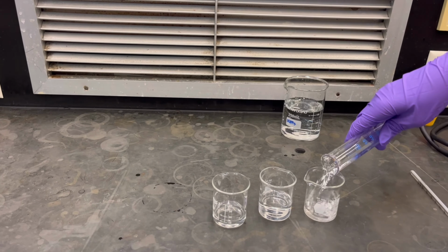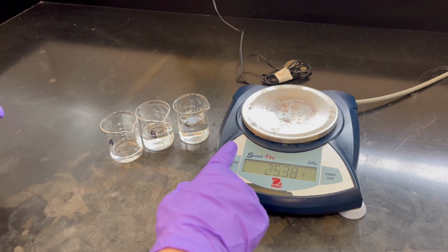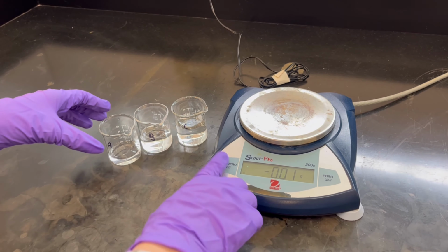After that, we're going to get our 3 beakers and measure the mass of each one of them and record it. Don't forget to zero your balance before measuring each mass.